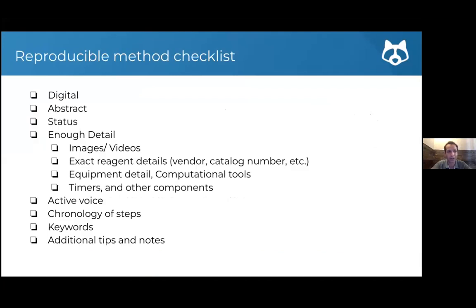Apologies for jumping around. And here's a sort of summary of the things that we've just gone over. So you'll have the link to the slides, and if you're writing a new protocol, just take a quick look at this checklist and make sure that you've thought about what's inside my protocol, not just where am I sharing it. And with that, I will stop and see if there are more questions.